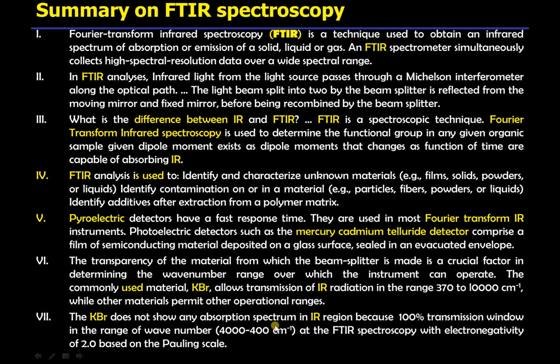KBr does not show any absorption in the IR spectrum region because it is totally transparent, and it has a 100% transmission window in the range of wave number 400 to 4000, that is the mid-infrared region, with electronegativity of 2 based on the Pauling scale.